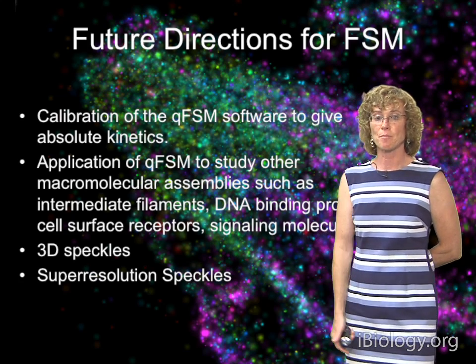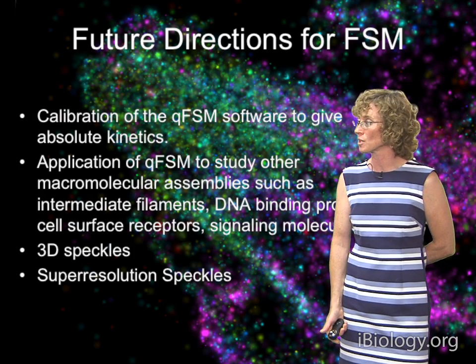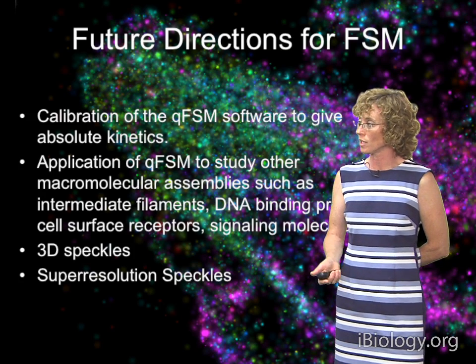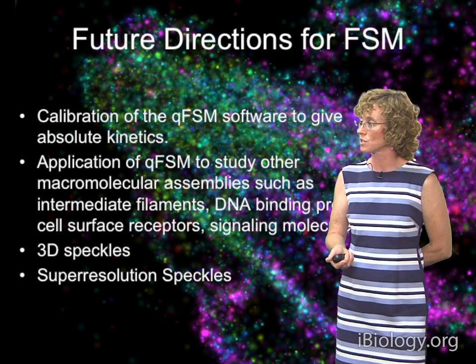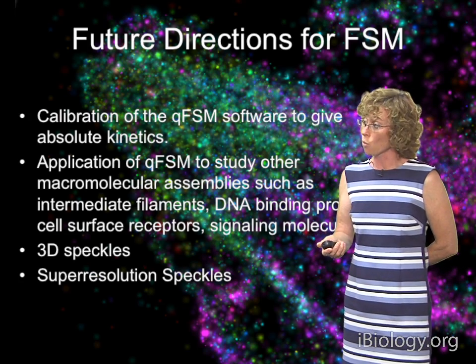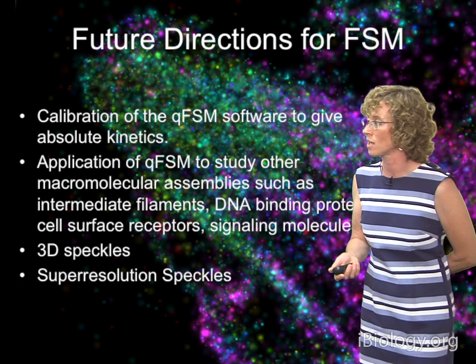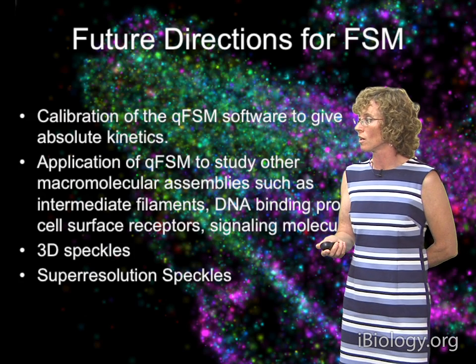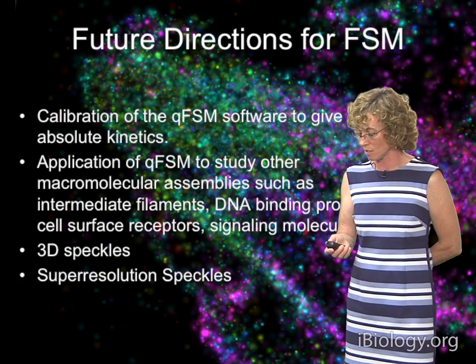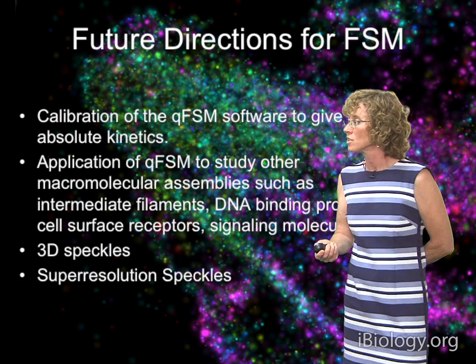We would like more people to adopt this technique. It's a very powerful technique. I think it would be a great technique for studying, for example, what's going on inside the nucleus with DNA binding proteins when transcription gets activated and things like this. Cell surface receptors, other cytoskeletal elements such as intermediate filaments, signaling molecules. Now, with structured illumination 3D super resolution microscopy, we think that we're going to be able to actually start tracking speckle dynamics in 3D in living cells as they move perhaps through living animals. So that's where we're going.